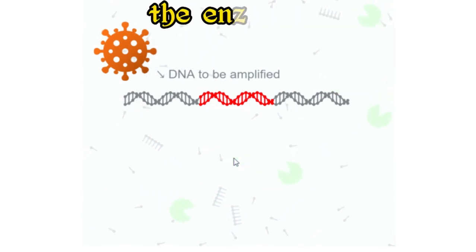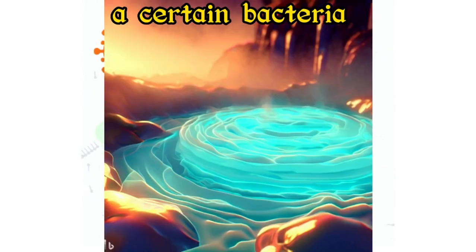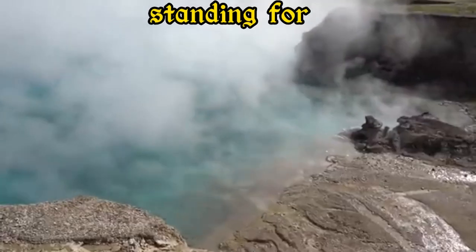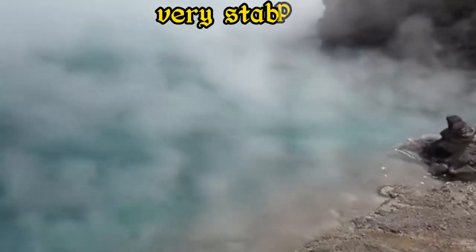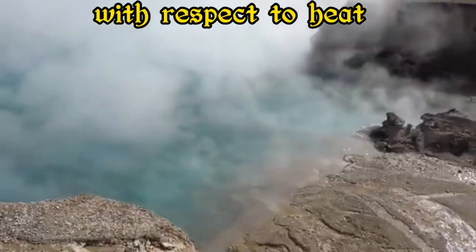The enzyme that we are going to use, this DNA polymerase, is derived from a certain bacteria which is very stable to heat, and is called Taq. So it's called Taq polymerase, Taq standing for Thermus aquaticus. This bacteria actually lives in hot springs, so it is very, very stable with respect to heat.